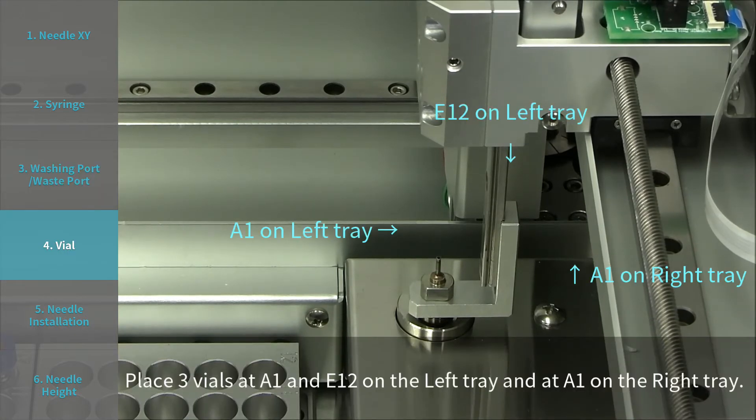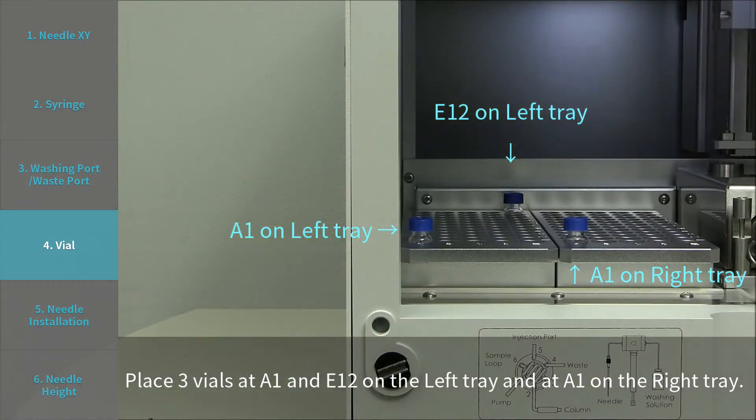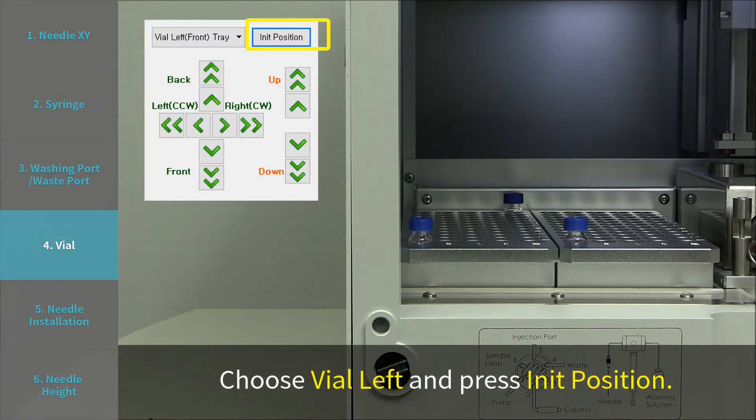Step 4: Vial. Place three vials at A1 and E12 on the left tray, and at A1 on the right tray. Choose vial left and press INIT position.